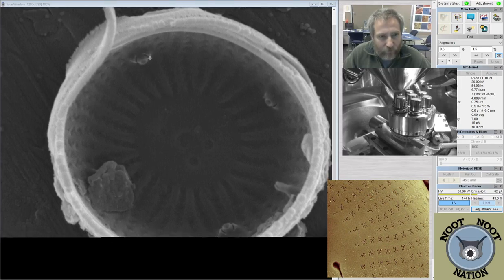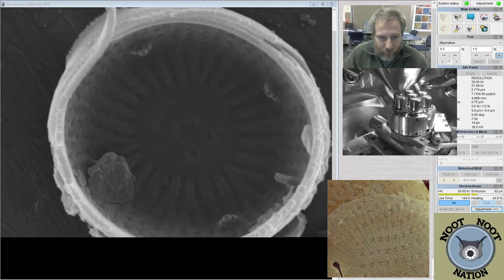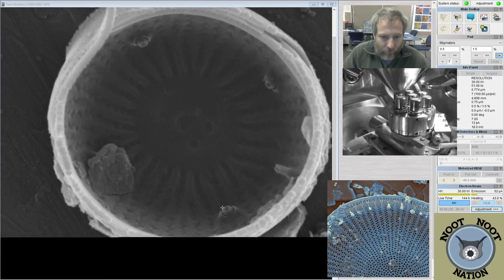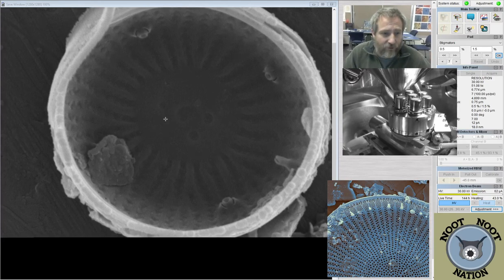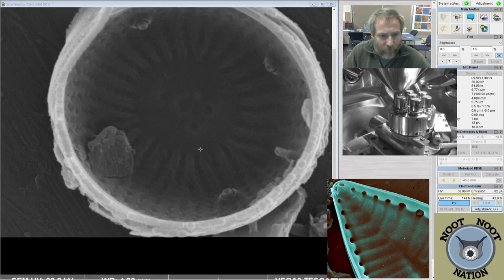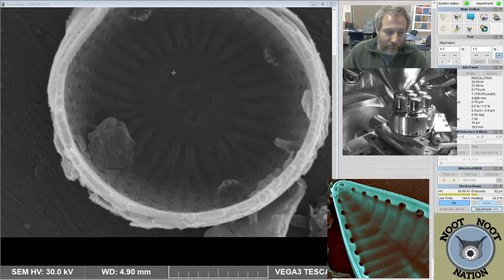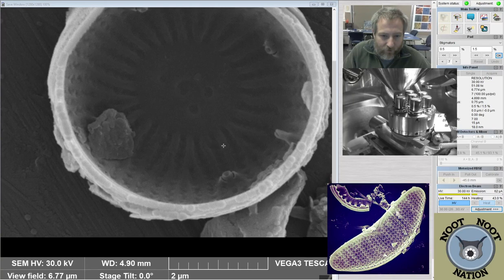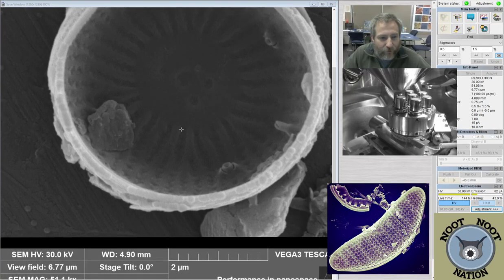Oh, it could be a Discostella, actually, because it looks like the mantle fultoportulae are between costae, and that's the case here as well, and the rimoportula is between costae too, and that's a characteristic of Discostella. The really little Discostella are kind of hard to tell what's going on with them, but this flat central area with no striae means it's not Cyclostephanos. And the presence of those things between actual costae suggests it's a Discostella to me. So, pretty quickly figured out what it was.